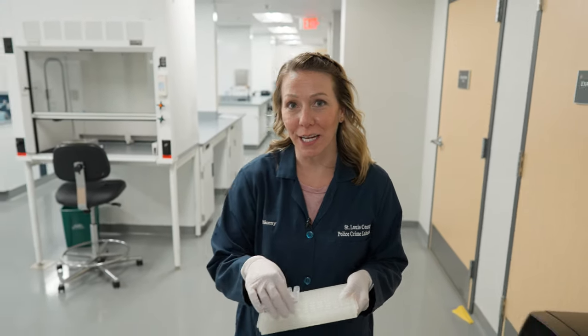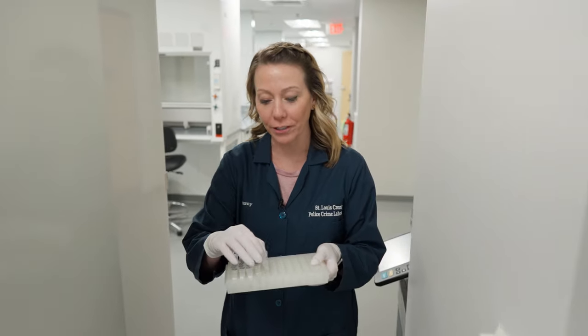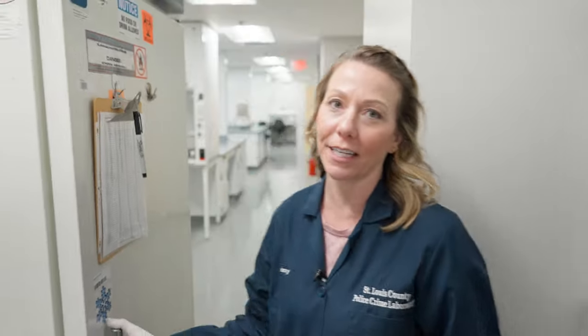After the items have been screened and sampled, they are placed into these tubes. These tubes are then placed in the freezer for the DNA analysis.